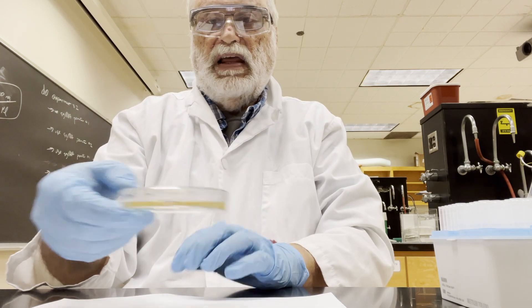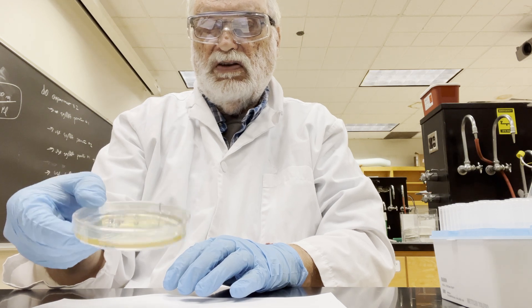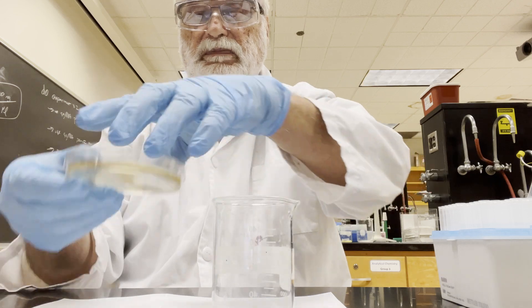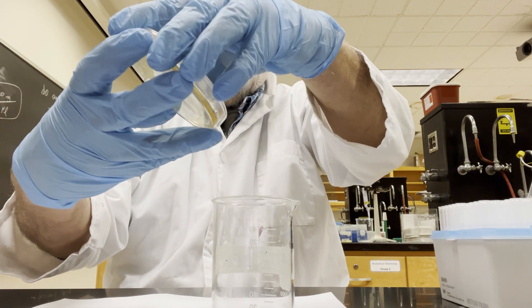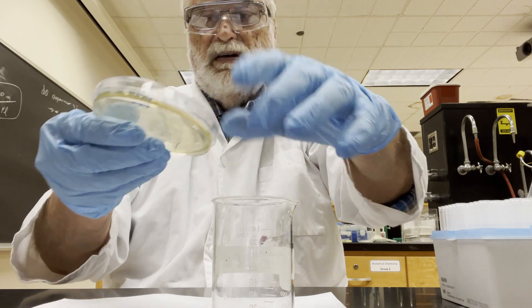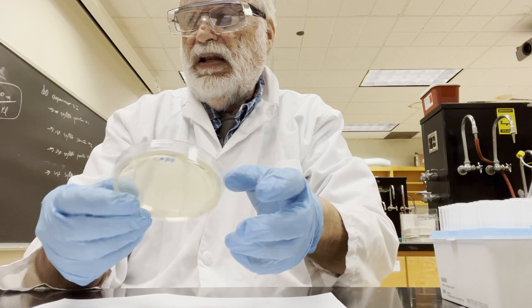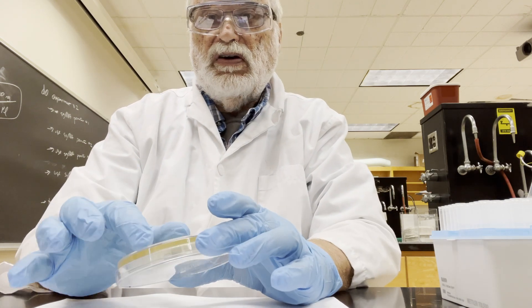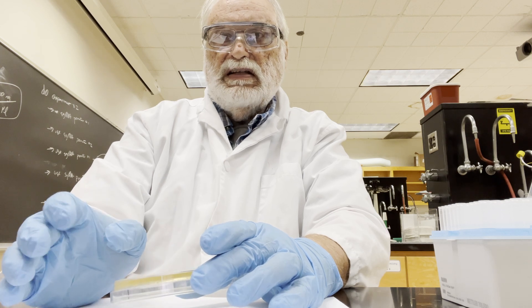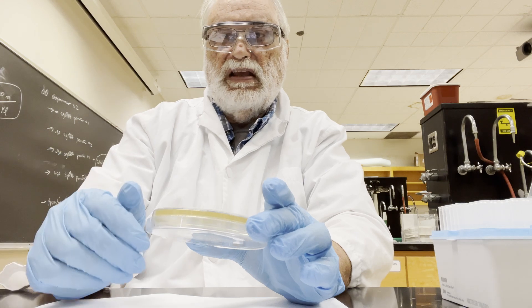Once you've run the beads all over the plate for a little while and the plate is starting to look a little dry because you've spread the liquid around, what you do is get your waste beaker, tilt the plate, get the beads to run off the side, and tap them into the waste beaker. We reuse these by putting them in alcohol and re-autoclaving them. Then go ahead and write your name and the sample ID on your plate and take it over to give it to me or the TAs.